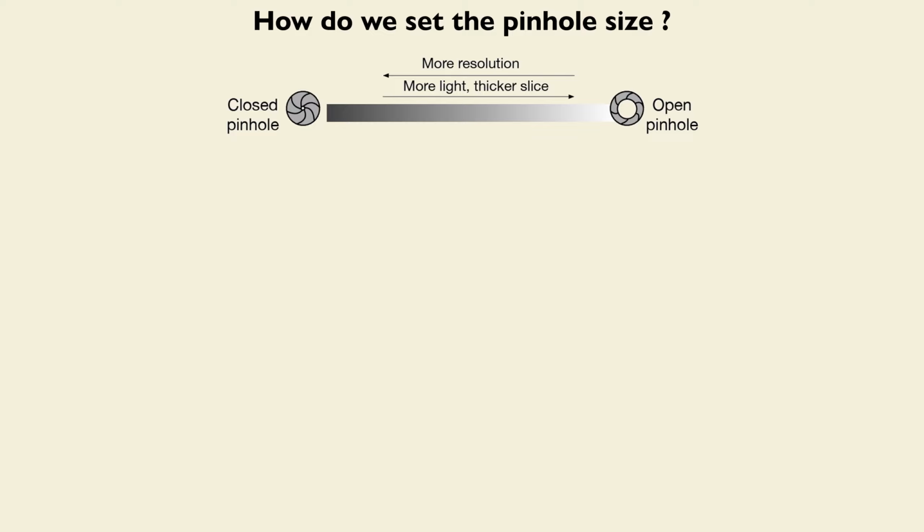So you can imagine when you use a confocal, you are looking at samples, and with these optical tricks that I mentioned in the previous slides, it's as if you're taking your sample and cutting it into sections. But you're not physically cutting them, you're cutting them with this optical trick. Because of that, this process is called optical sectioning, and we talk about the thickness of the slice as a parameter that we can consider.